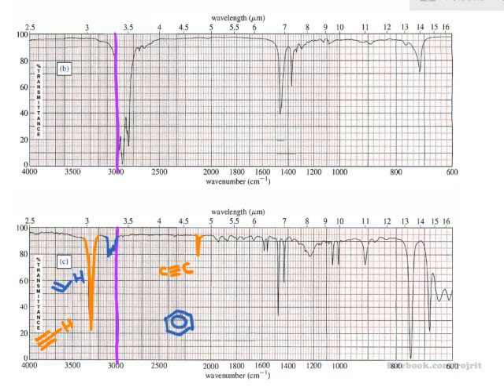So how can I know that this is the benzene ring, not a simple alkene? First of all, for the benzene, you have firstly the C-H of the sp2 carbon, and then secondly, at the double bond region, you have 1, 2, 3, and 4. You have 4 peaks of C double bond C, right?